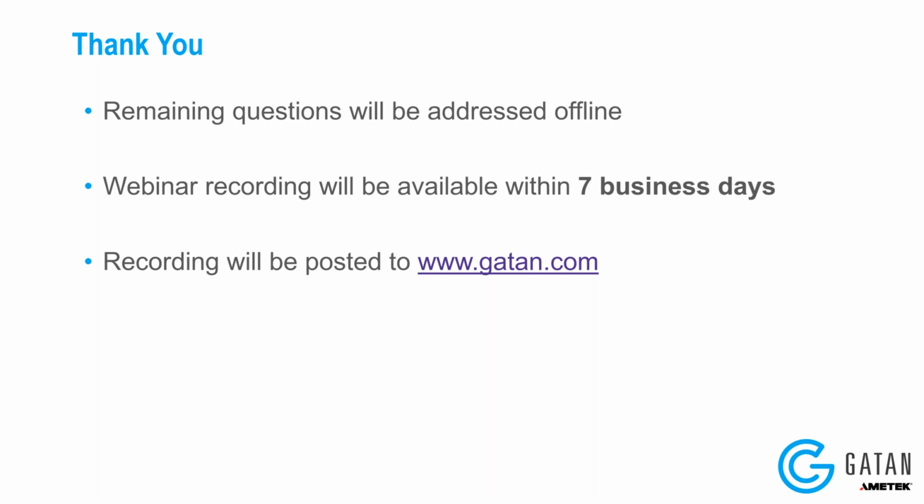Okay. Next question that came in is, your last example showed 0.7 degrees precession diffraction, so PED. PED may be rather complex to align. Do you have special software in STEMx for precession alignment? Yeah, so right now we're developing this plugin for precession for STEMx that can do these kinds of precession experiments.